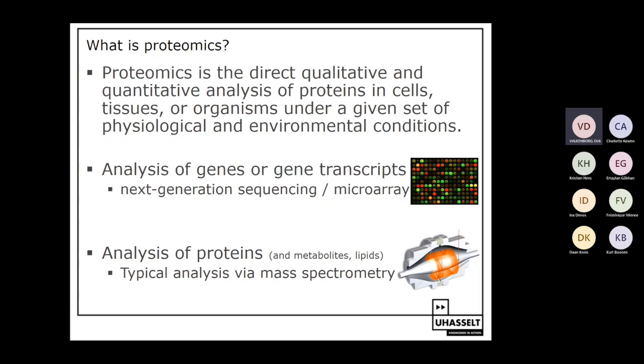When I say closed box and open box, I mean that with mass spectrometry we don't know exactly what we're looking for, and with closed box solutions like Olink and SomaLogic, we know the proteins we're looking for. That's more like a targeted approach versus an untargeted approach.